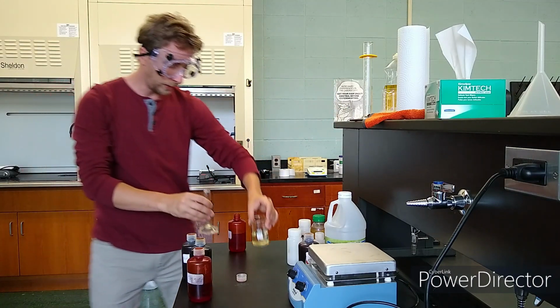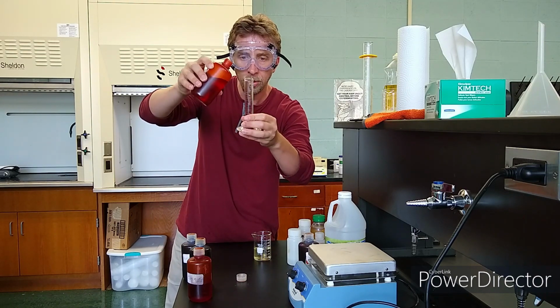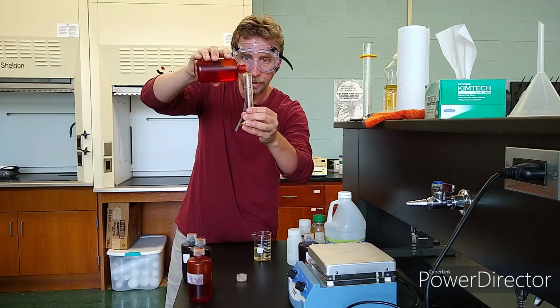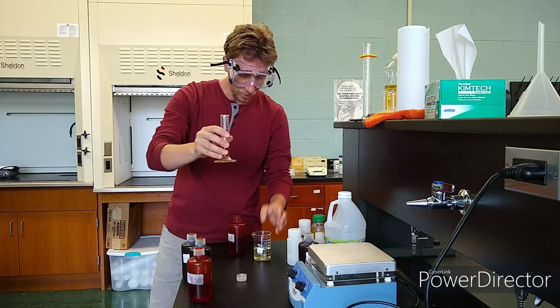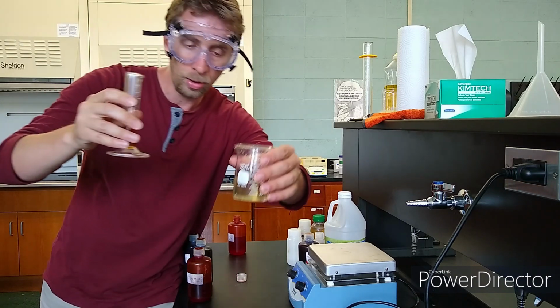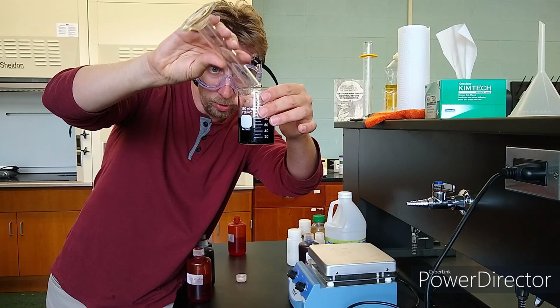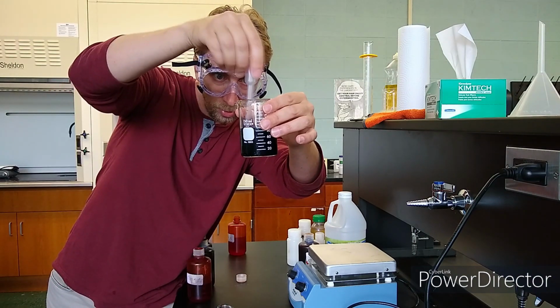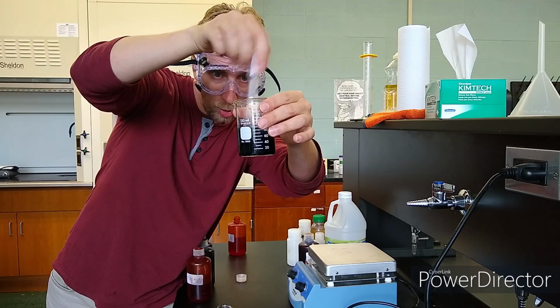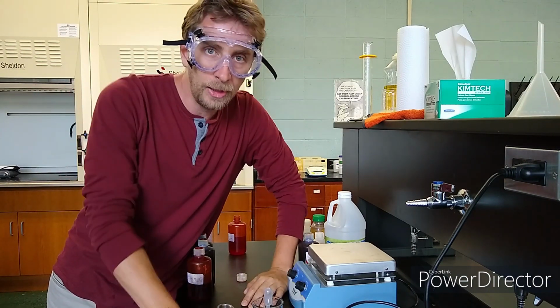So that's 20 total milliliters. And because it disappeared so fast, guess what? I'm going to go up to 10 more milliliters. Now I know this is a lot. Let's give it a shot. That'll be a total of 30 milliliters roughly. Down the hatch. Oh, that color is dark. Think it's going to disappear? No, it didn't.